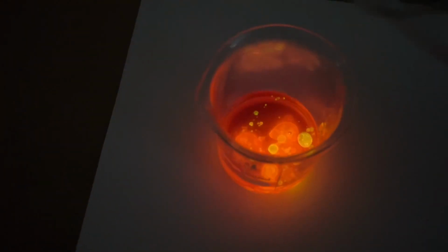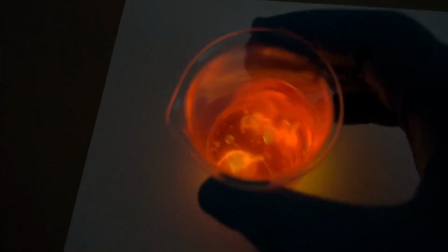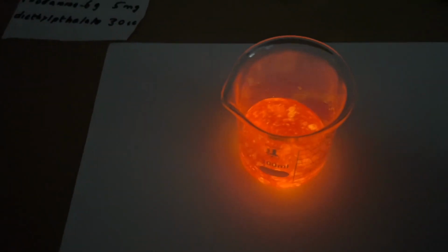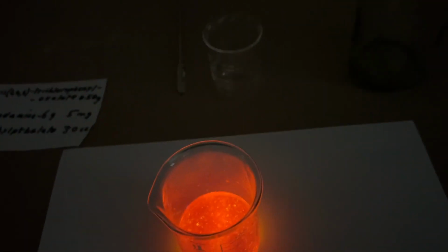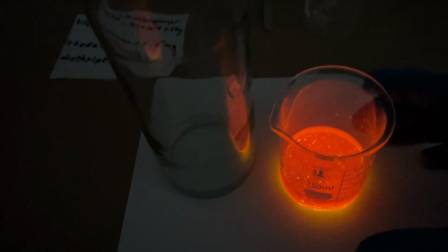Now I'm going to add in the peroxide. Here goes. Instant light. Swish it around a little bit. Now to mix it better, I don't have a stir bar, so I'm going to put it in this bigger bottle where I can actually shake it a bit. And that should really demonstrate the effect, but isn't that amazing?